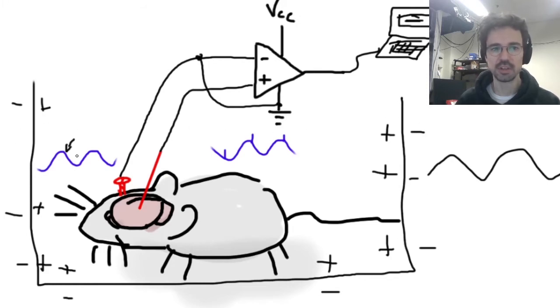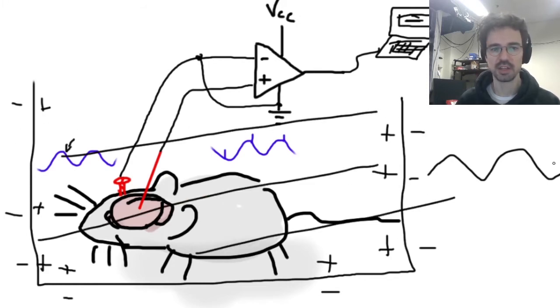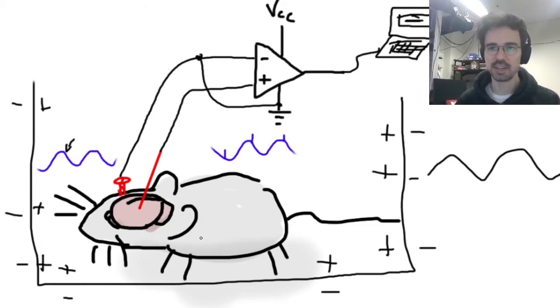So the interior field that is in this box now, because it's a Faraday cage, is homogeneous. So there is no problem with charging part of the animal differently from another part of the animal. But instead here, we're just talking about the case that the electrical potential of the cage is not the same as the electrical potential of the animal.